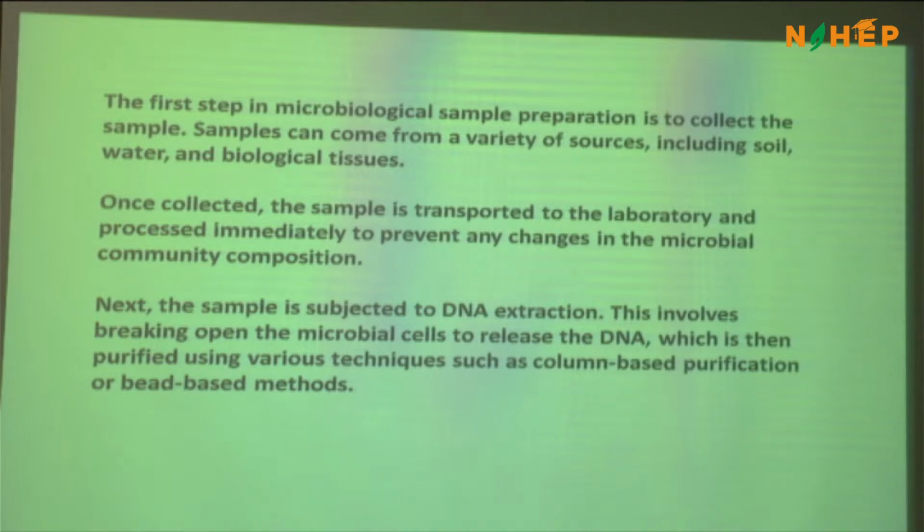It was repeatedly said that the same sample is analyzed using different approaches, correct? A portion of the sample goes for the so-called meta-barcoding, if it is microbiome profiling. A bit of the sample goes for culturomics through a plate count or plate assay. A third portion goes for maybe imaging, right, using different kinds of microscopic analysis. Yesterday one of the groups was talking about scanning electron microscopic images of rice leaf. It's all done on the same sample, right? Maybe a fourth portion may go for long-term preservation as well.